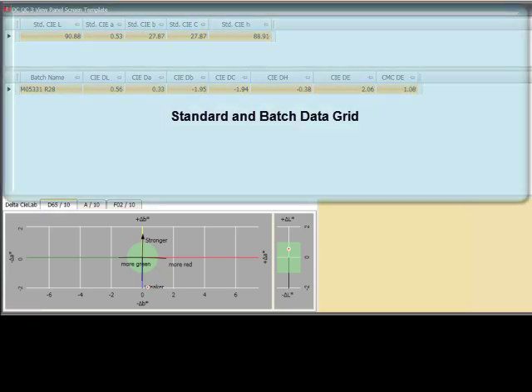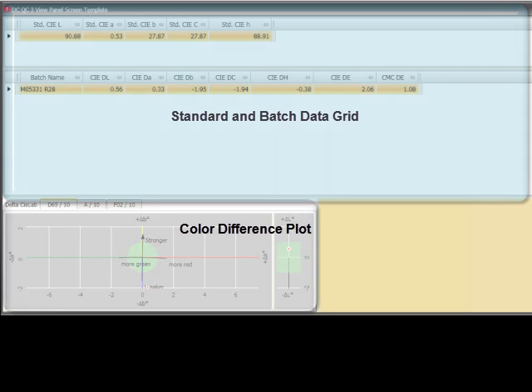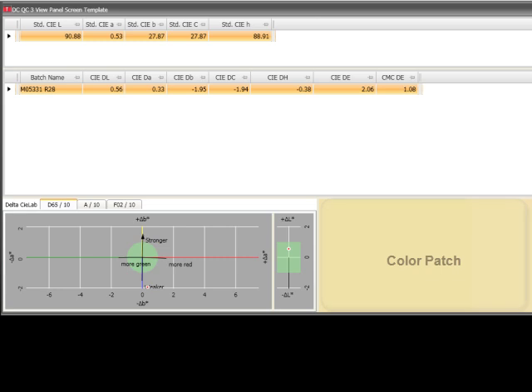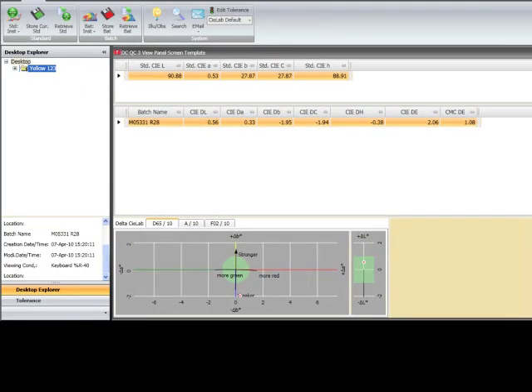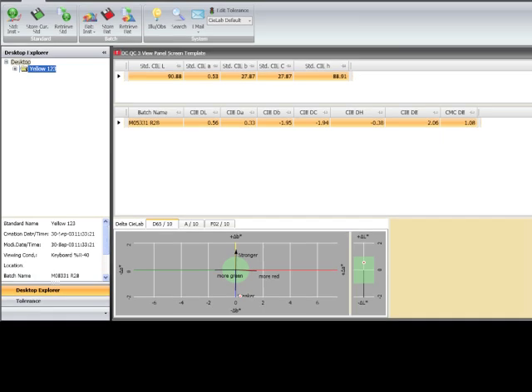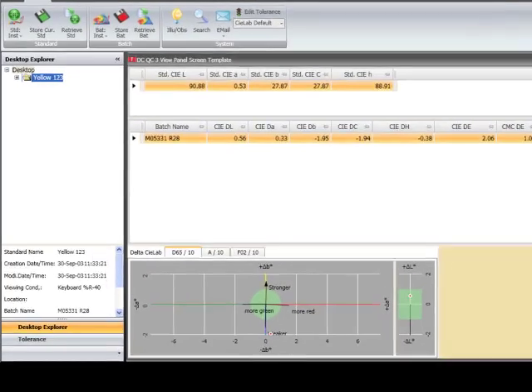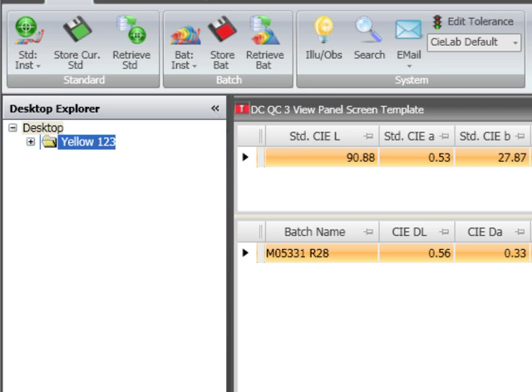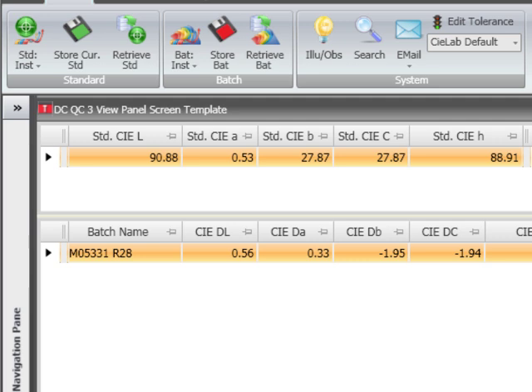The template shows three distinct areas: a standard and batch data grid, a color difference plot, and a color patch. As can be seen, our standard and batch data is visible here. If more room is needed to display more of the template, the user has the option to minimize the desktop explorer by clicking on the double arrow in the top right corner of the navigation pane. Clicking on the double arrow again restores the pane.